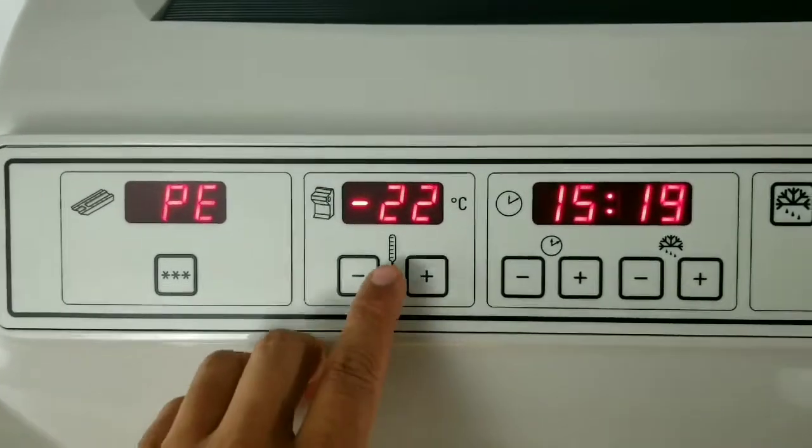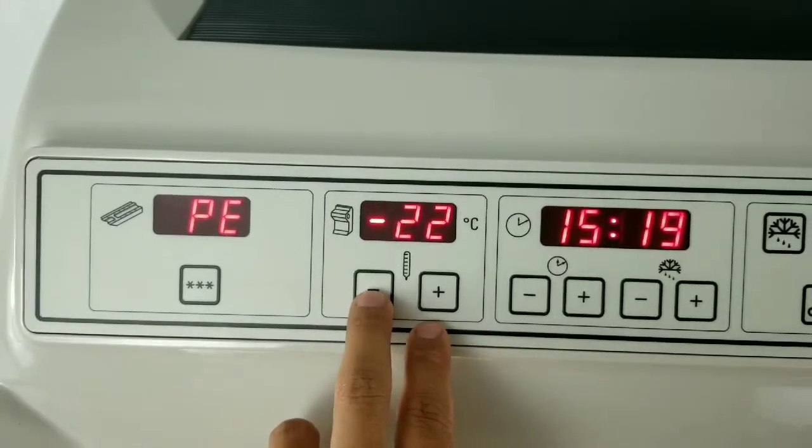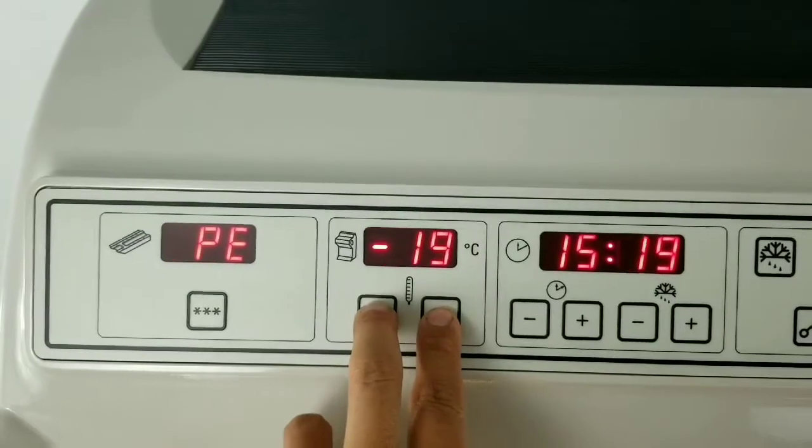The next is the cryo chamber temperature. This is the actual temperature, and if you want to adjust that, all you have to do is press the negative or the positive and set it to where you want it.